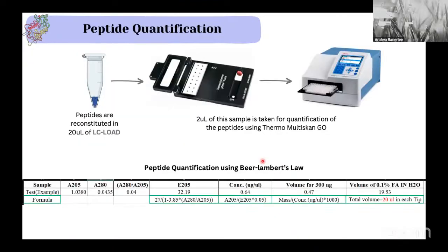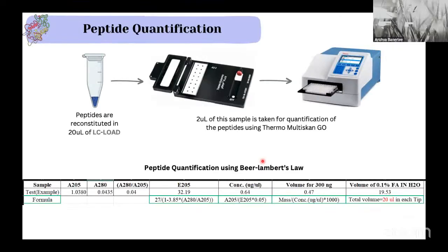We parallelly go for peptide quantification. What we have done for the peptides, and next, once the tips are prepared, we will go for the mass spec quantification. So the professor can give a brief initial exposition of the mass spec: what are the kinds of mass specs which are available for this kind of analysis? Back to you, professor.